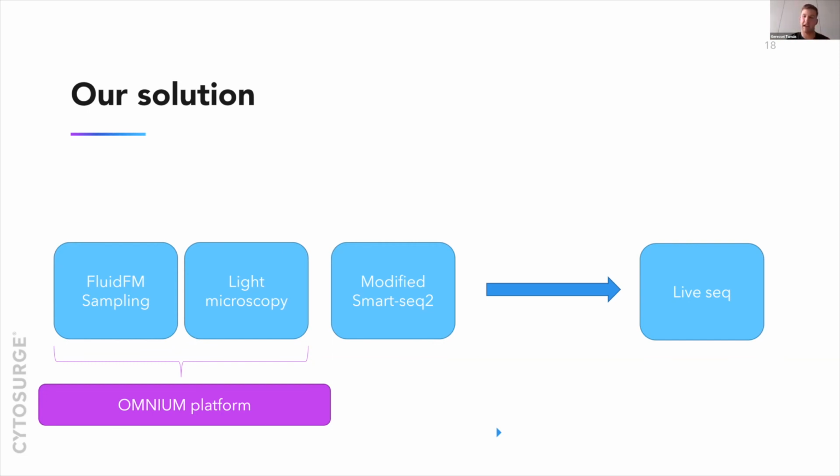Depending, do we do some kind of treatment or does it differentiate? What kind of events happen during its lifetime? We can really characterize the same single cell when it comes to its cytoplasmic contents. Of course, the challenge is enormous because the biopsy is tiny. It's a few picoliters. And then it's really taking cutting edge methods to characterize these few picoliters of extract.